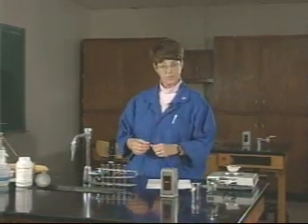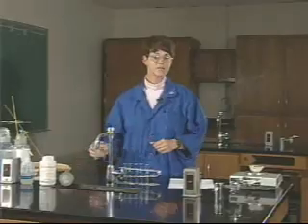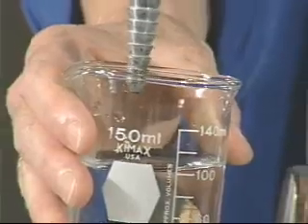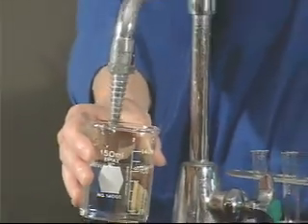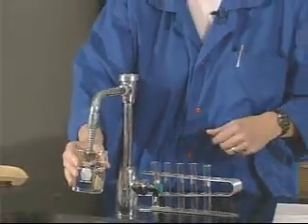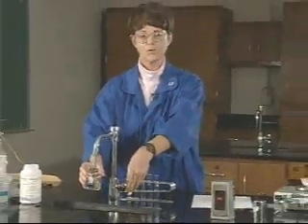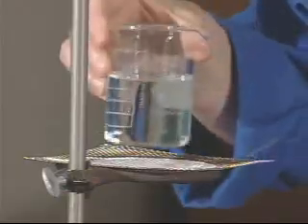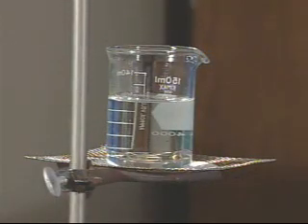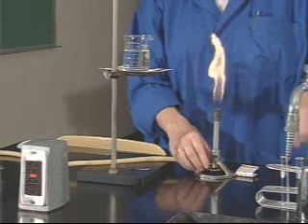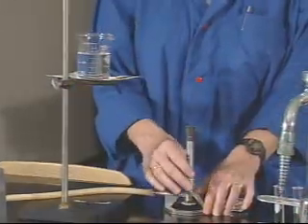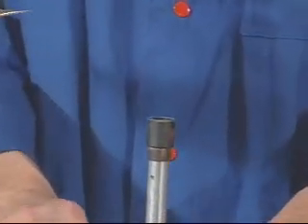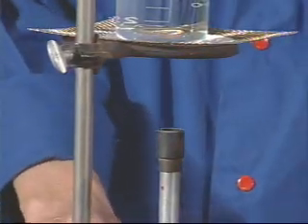Once you've determined the mass of the evaporating dish assembly, you then are going to need to heat this to drive away the water so that we can find out how much salt was dissolved in the solution. Fill a 150 ml beaker approximately half full with tap water. You then can put the beaker on the wire gauze and light the Bunsen burner and begin to heat the water. You want to adjust the flame to about three or four inches, and remember that we want a nice warm, non-luminous flame, so we have to twist the barrel to admit air.